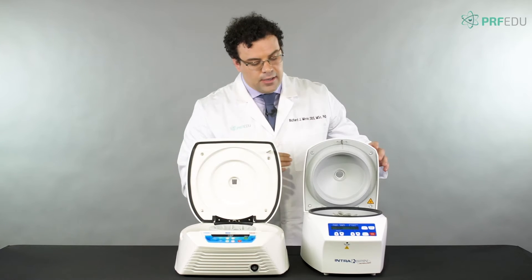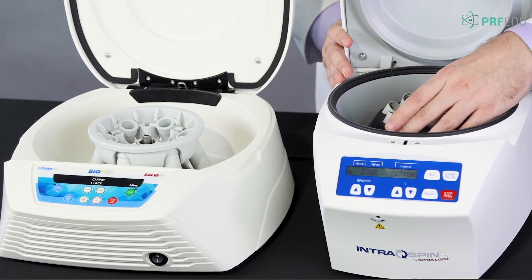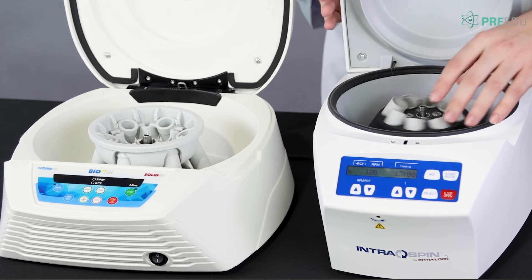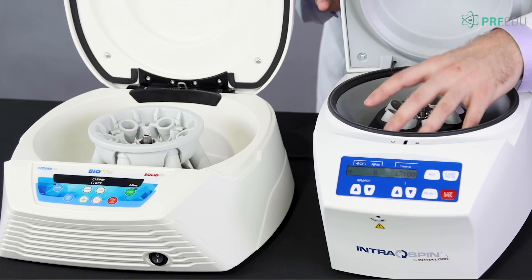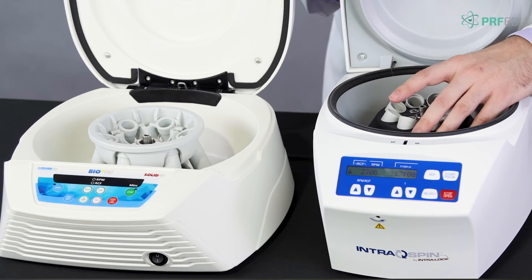Looking inside, the fixed angle centrifuge has a rotor — like a little toupee — where the tubes rotate at 45-degree angles in a fixed position. That's why it's called fixed angle centrifugation.